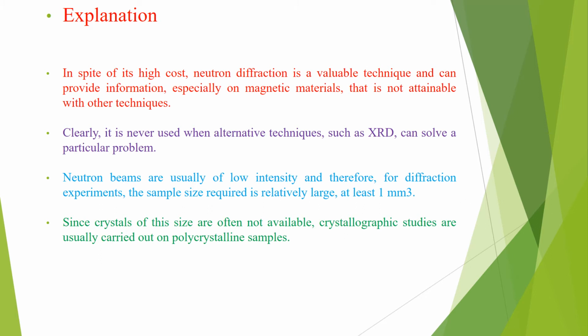Neutron beams are usually of low intensity, and therefore for a diffraction experiment the sample size required is relatively large, at least 1 cubic millimeter.